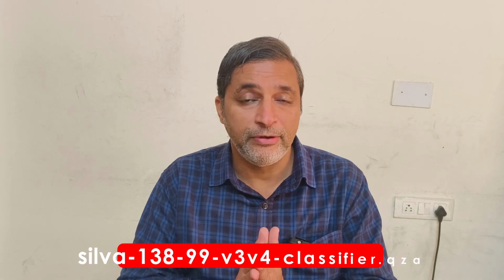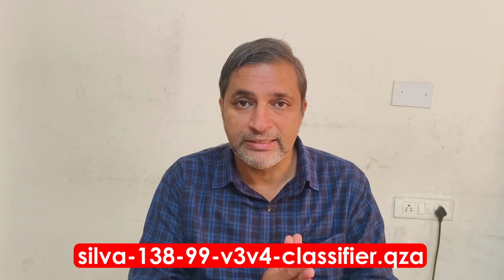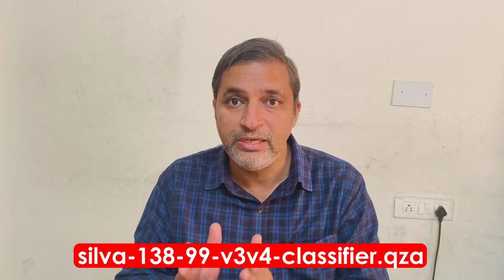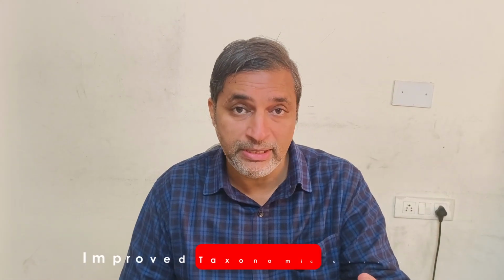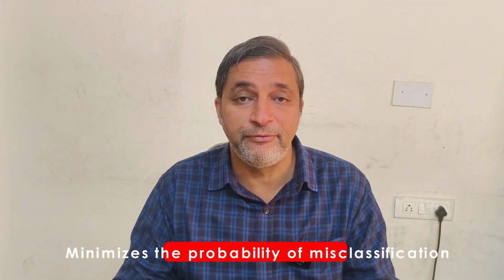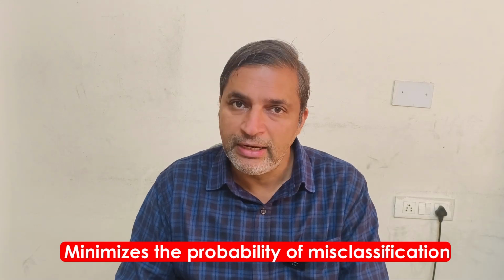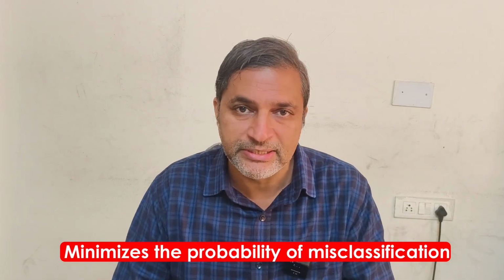In particular, we are going to use the reference database classifier silva-138-99-v3-v4-classifier.qza file, as you can see on your screen. Using a region-matched classifier first improves the taxonomic accuracy, while also avoiding any misclassification which can reduce the accuracy of our data analysis in the subsequent steps.